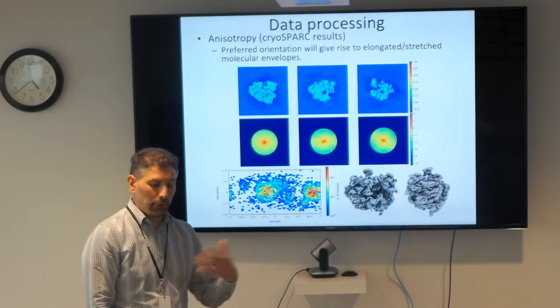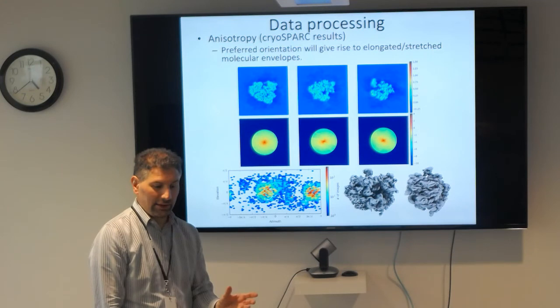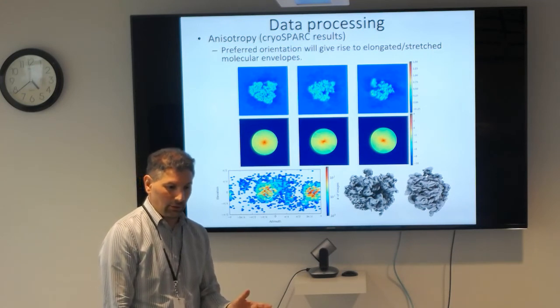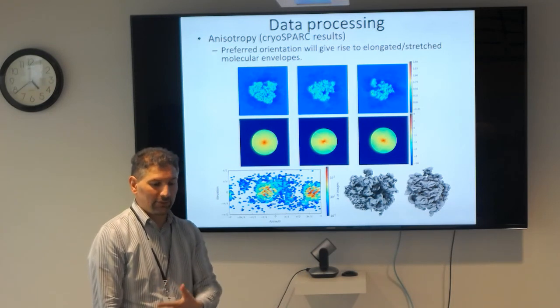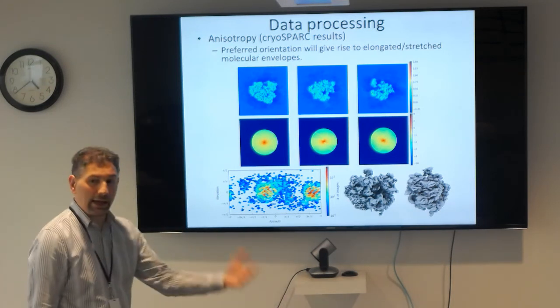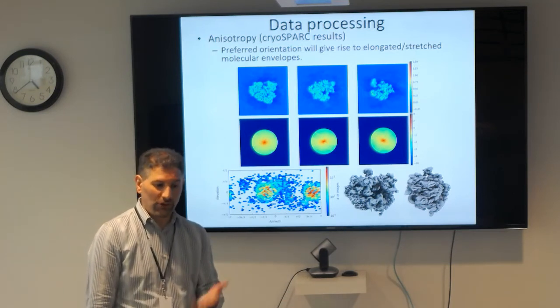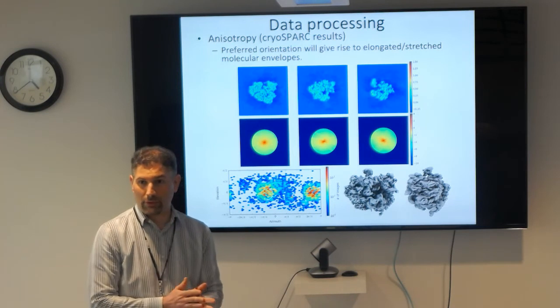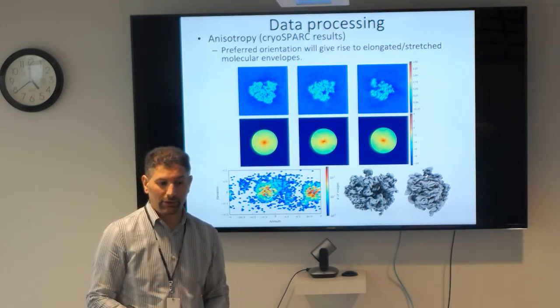As you purify the preferred orientation out, you get a better reconstruction that is more isotropic, and that gives you better references. So the few particles that have that rare view are going to align to it better. And as you iterate, you're essentially fishing out the rare views. So 3D classification could actually be used to deal with anisotropy.